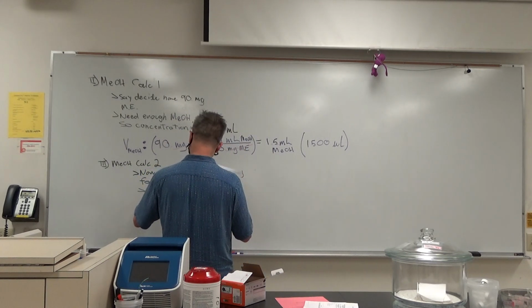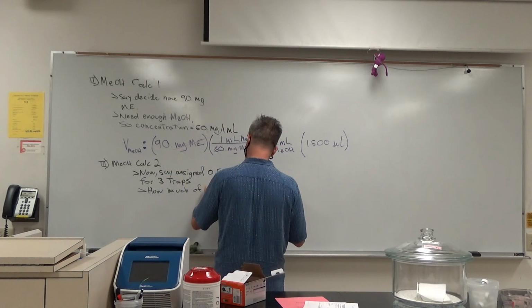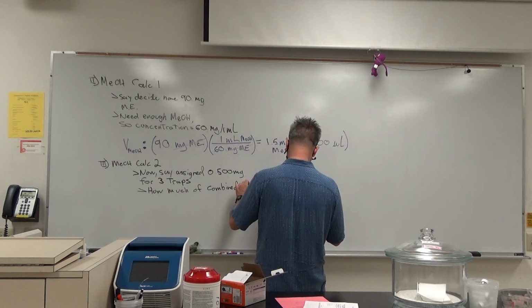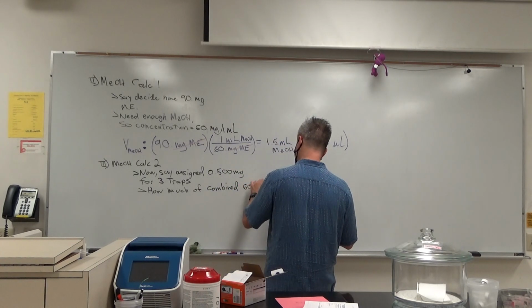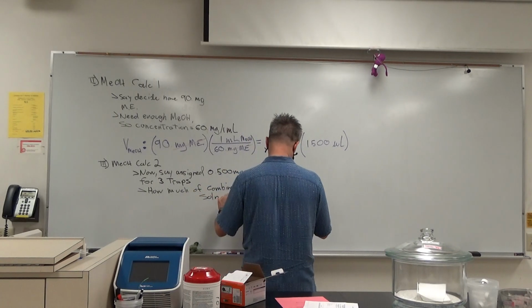How much of our combined 60 milligram per ml solution do we use?